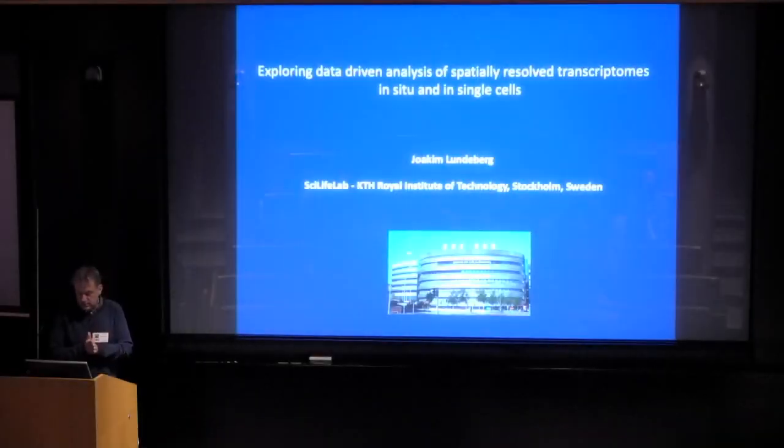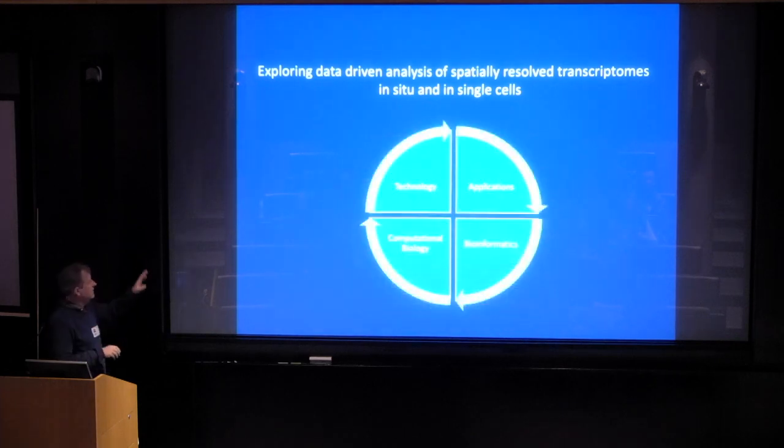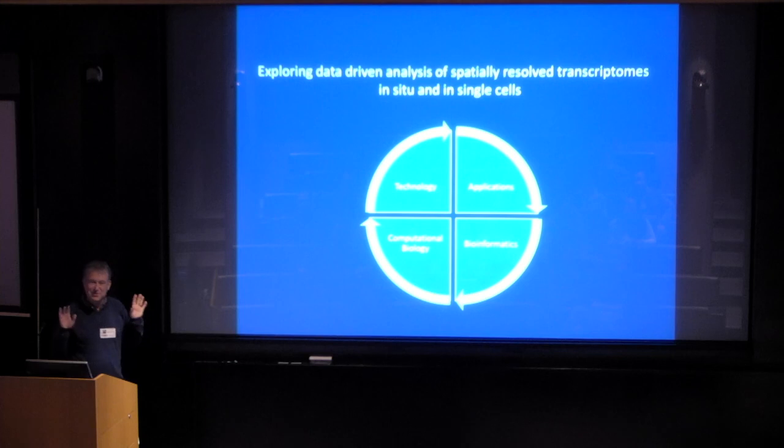So today I'm going to talk about how to explore spatially resolved transcriptomes. And just to get a feeling, my background is actually from the left part here, it's technology. And then we try to apply that in sexy applications, but it kind of comes into the field of computational work as well, doing applied mathematics and also trying to develop tools. I'm super uncomfortable to talk about the computational tools, just as a disclaimer for this talk, but I'll show some of the results that we obtained by doing this.